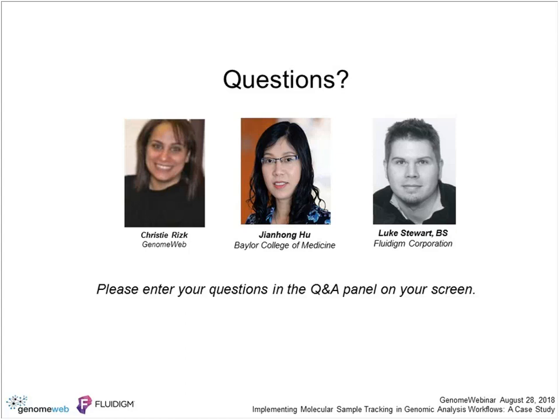Jianhong, do you have an estimate of the time or the money that you saved in your next generation sequencing workflow or genomics pipeline by incorporating molecular sample ID into your procedures? So actually, I would say we did not have a good answer for this because we never calculate how much we saved. We just use this as a QC step to find if we have any problems, any mistakes that happen in the pipeline. Of course, we saved a lot because any samples with the problem are removed, but we don't have a number for this.